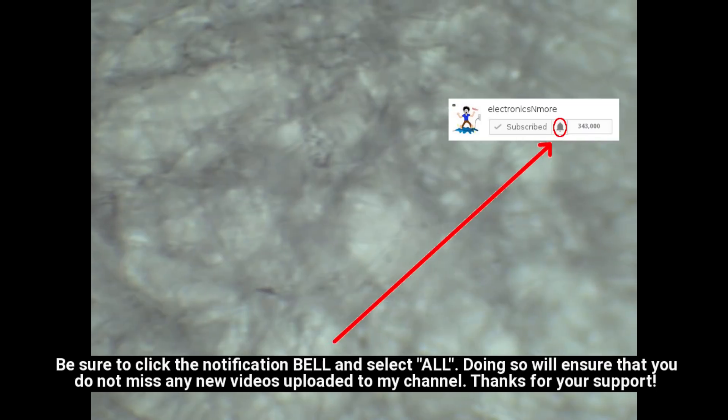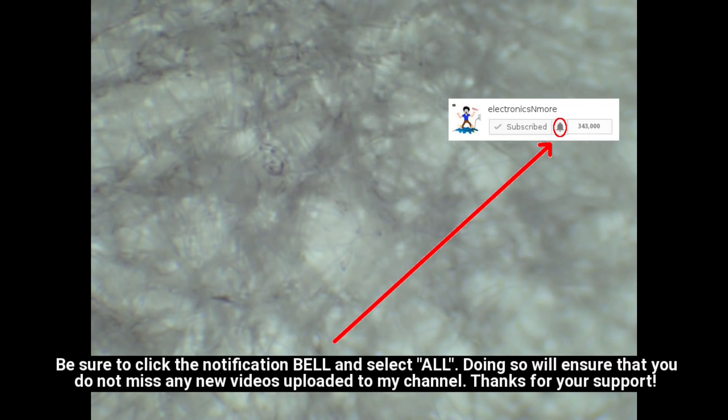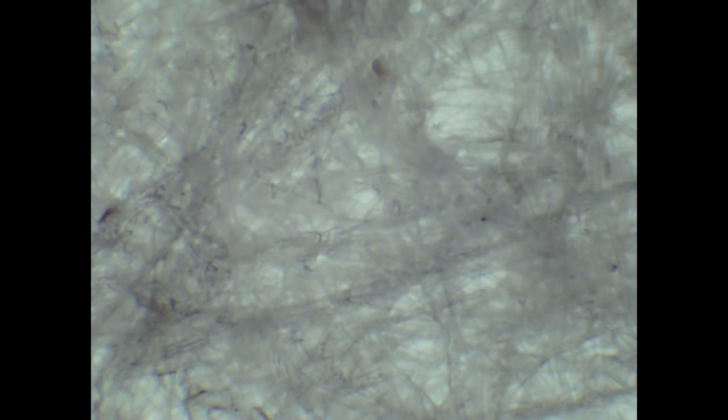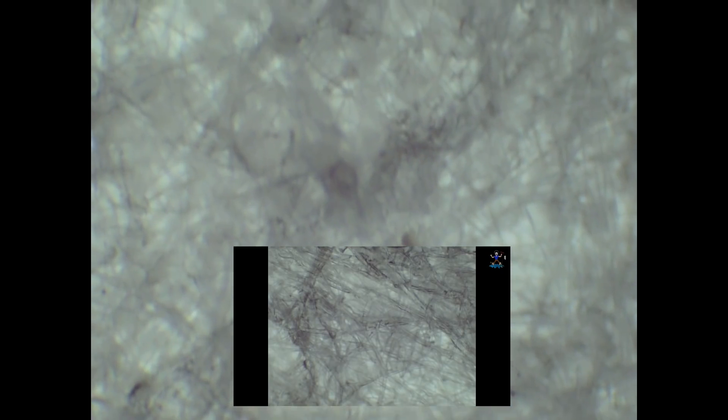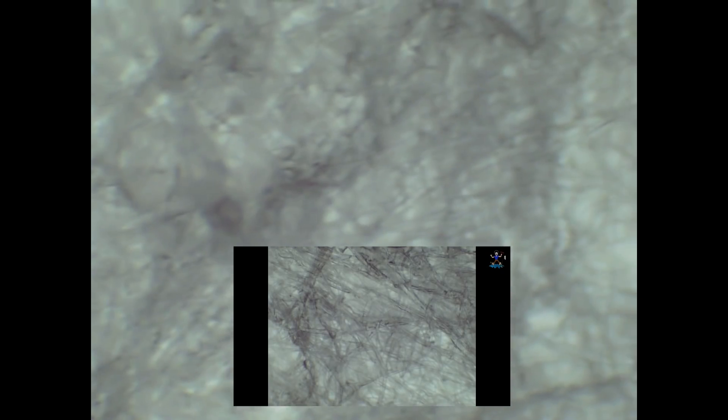You're now looking at the thicker center layer of the vacuum bag. And you can see at 40 times magnification, it resembles very closely the inner layers of the N95 mask. Very tightly packed fibers of varying sizes, especially smaller sizes. Here we're looking now at 100 times magnification. And you can see even at 100 times, there are many fibers that are extremely small.